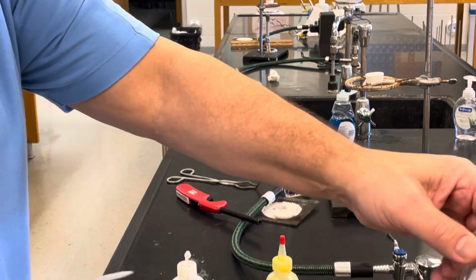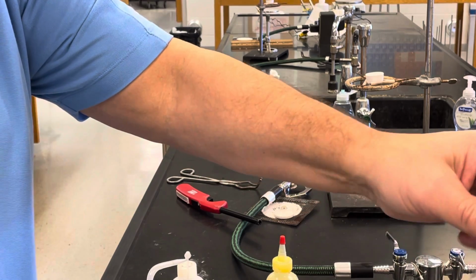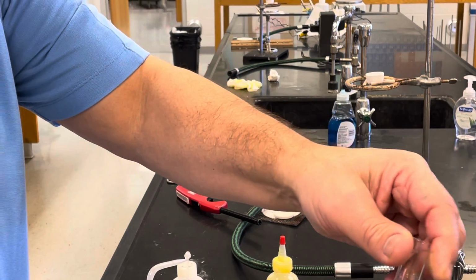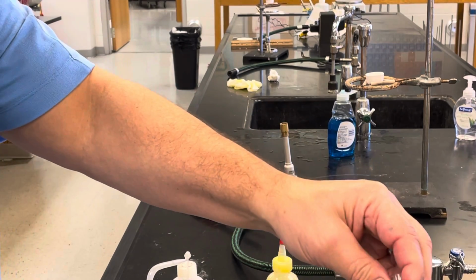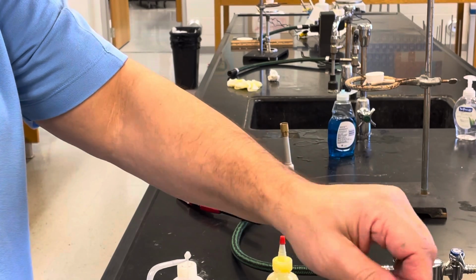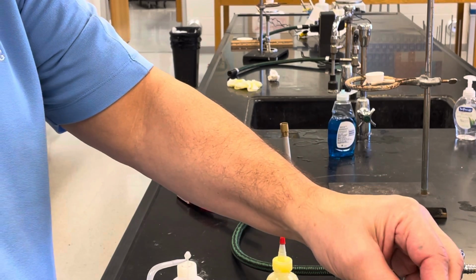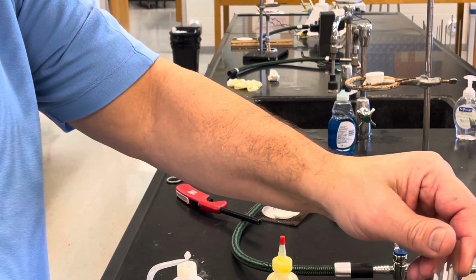And we're basically just dissolving the ammonium chloride into the water. Okay, nothing fancy's happening, but if I feel the test tube, it is very cold. So as a result, does that mean that the dissolving is endothermic or is it exothermic? Okay, hopefully you responded to yourself endothermic.